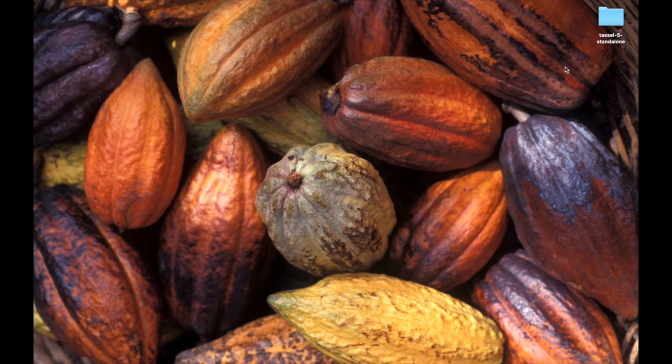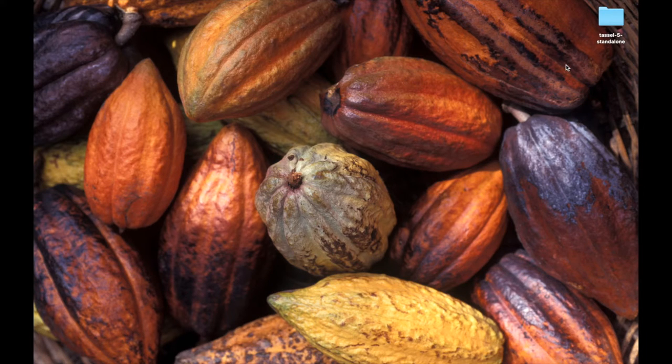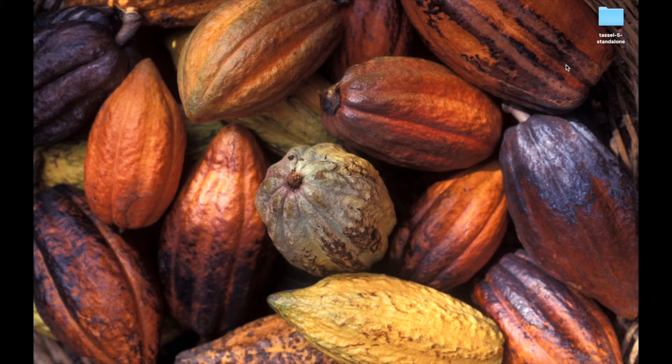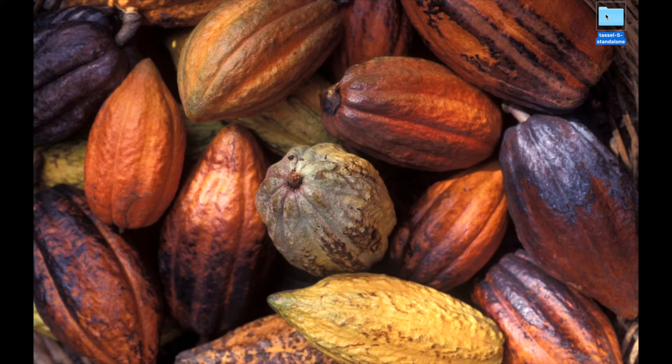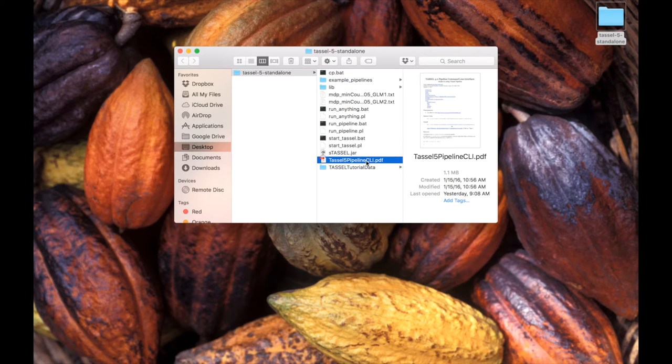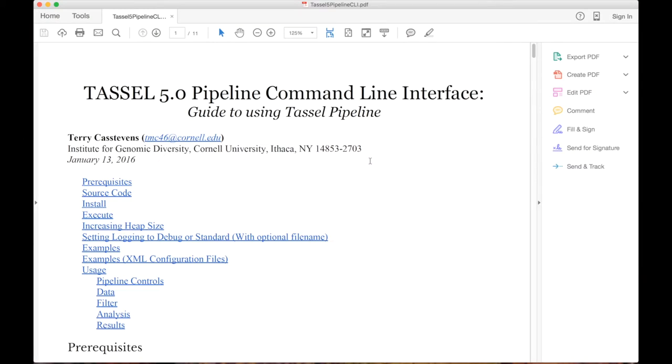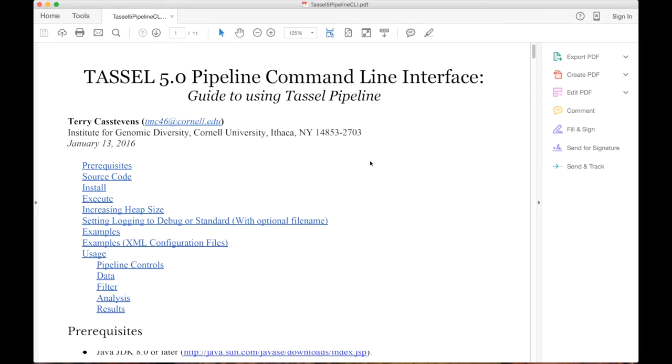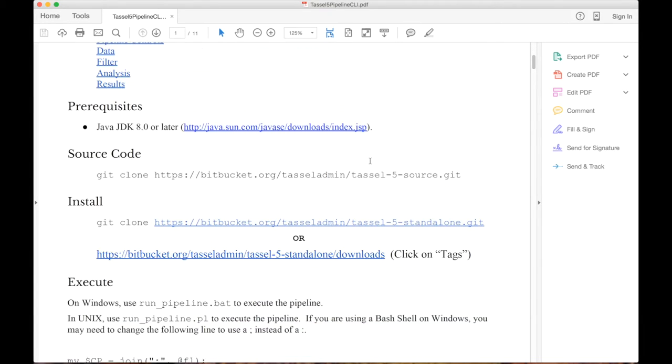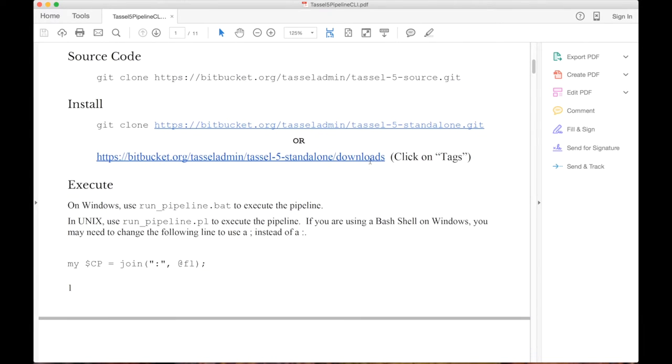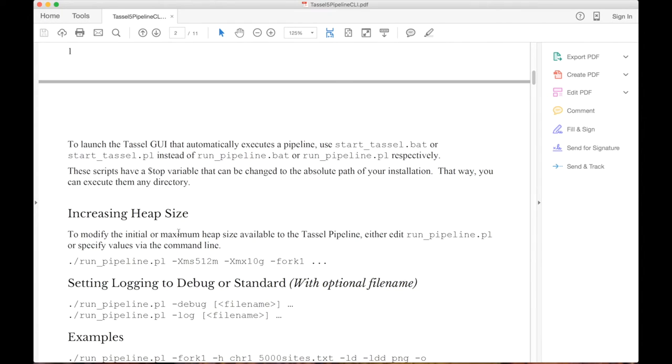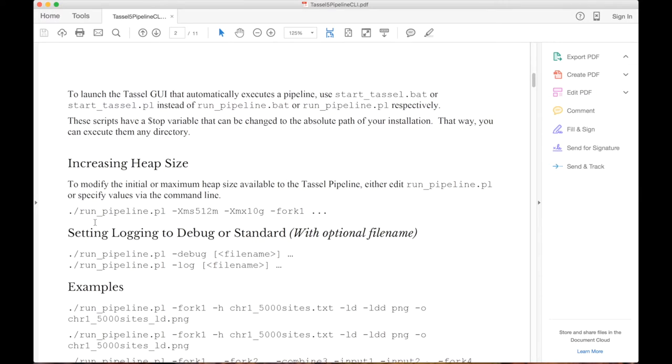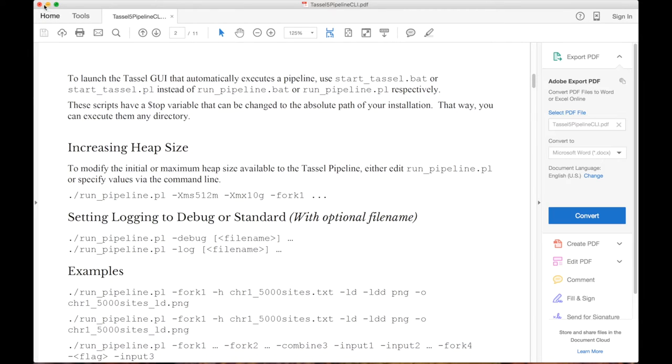I'm going to start by showing the location of the documentation for the command line interface just so that people know where to look for it. So here we have the directory with the standalone for TASSEL 5. Once you go in there you can see a PDF and that PDF shows you the commands that you can use, some of the interesting options on how to execute it, some things about increasing heap size. So if you have the standalone you can always go back to this documentation.